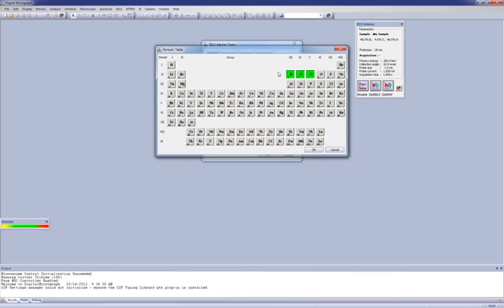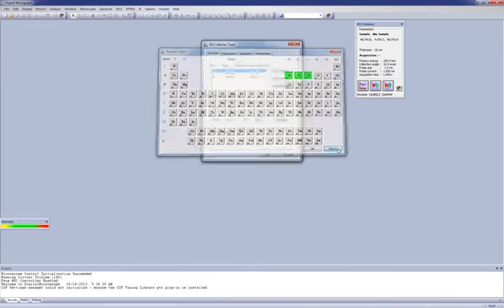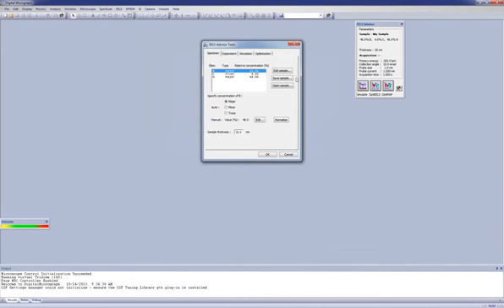There is a capability to edit the sample. You can just hit Edit Sample, which launches this periodic table dialog that allows you to adjust the elements that are present in your sample. There are buttons that allow you to save and open a sample at a later stage. And there are ways that you can specify automatically the concentration of particular elements by adjusting these radio buttons.